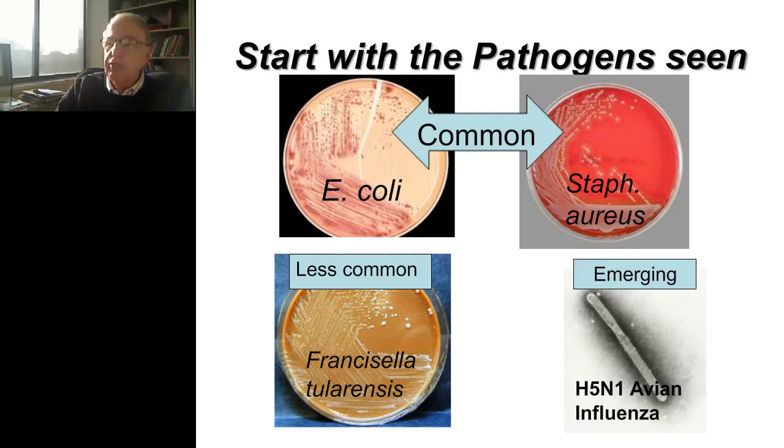I know in Iowa this past week I was told of a case of Francisella tularensis from a blood culture. And there were exposures in the laboratory because the cultures were handled on the open bench. They did not recognize at first the potential for Francisella tularensis. This happens in laboratories from time to time. And if Francisella tularensis is endemic in your region of the country, that's one of the organisms that you have to consider in your risk assessment process. As is avian influenza. We've been seeing this in different parts of the country in past years, so it's something you have to consider. It has potential.